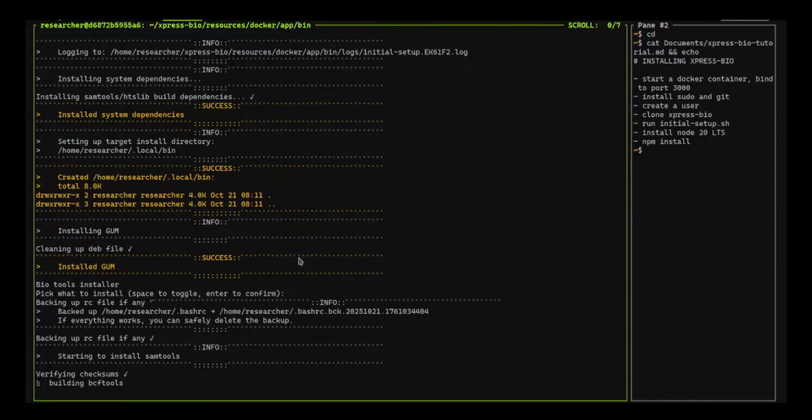Shouldn't take really long. The longest step is the SAM tools and also downloading the Blast+ from NCBI. For whatever reason, sometimes the download goes really fast, but sometimes you get stalled and the download goes really slow. So those are the real limitations.